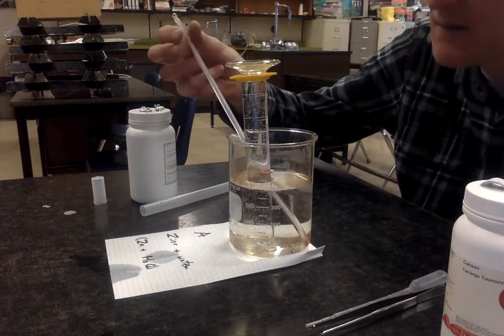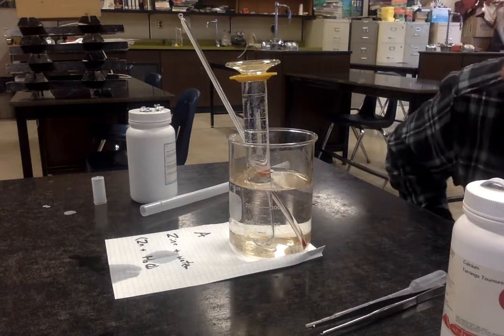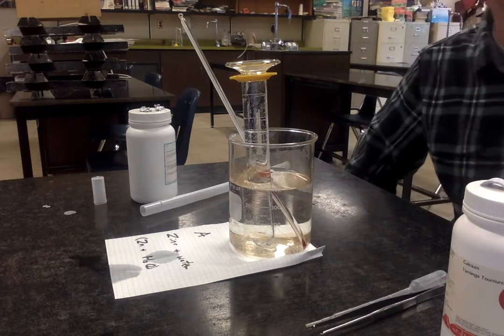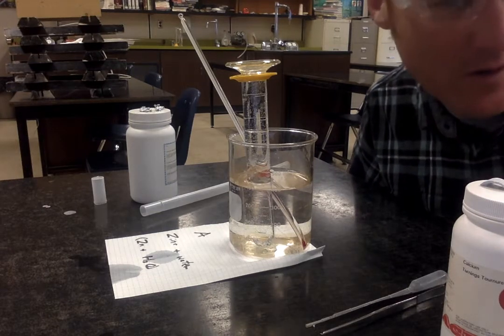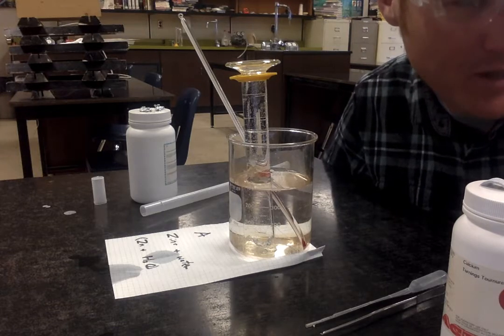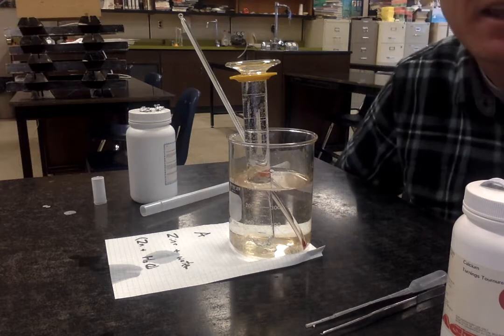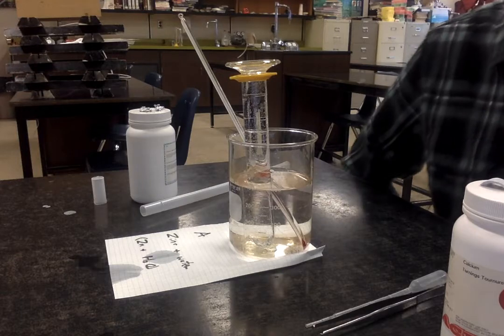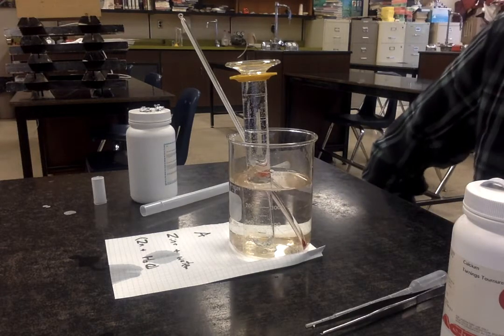Good time to measure the temperature. Should have done that before. In fact, temperature is exactly 20 degrees Celsius in the zinc, and also 21.5 degrees Celsius in the calcium container. That being said, I haven't added any calcium yet, so that's just a baseline temperature.